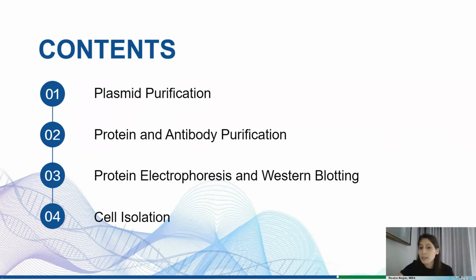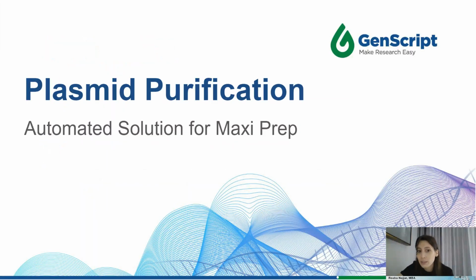For today, I'm going to be taking you through a couple different workflow applications that the team has really developed and fine-tuned. The first one is going to be the plasmid purification. After that, I'll be talking about the protein and antibody purification solutions, and then the protein electrophoresis in Western, and finally the cell isolation. And of course, at the end, I'll have some time to take some questions.